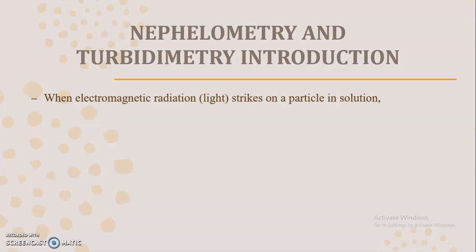But in nephelometry as well as turbidimetry, our solute is not in the dissolved form. It is not part of a homogeneous solution. Heterogeneous solutions like suspensions are present, and they can be analyzed by using nephelometry as well as turbidimetry.